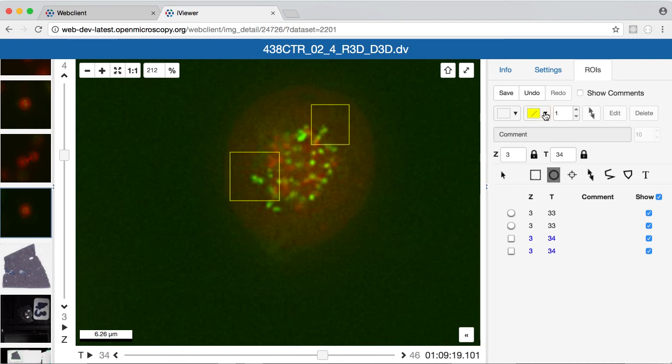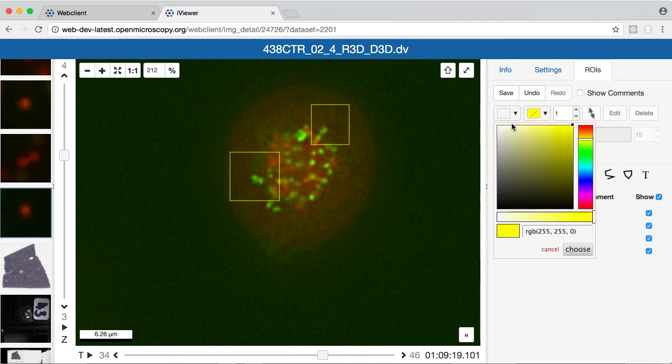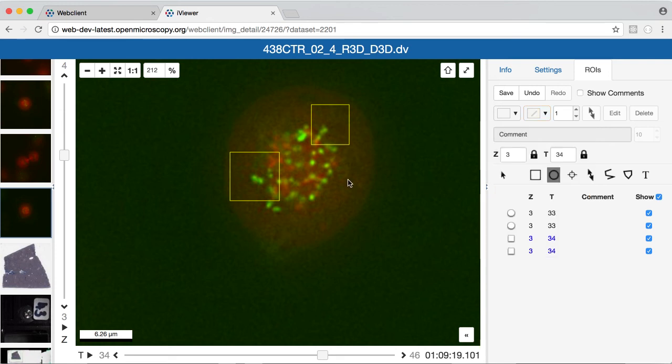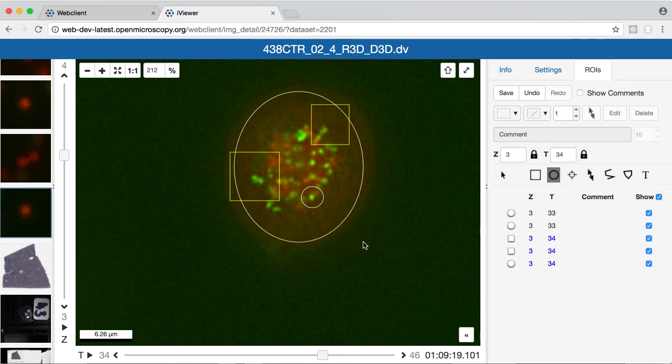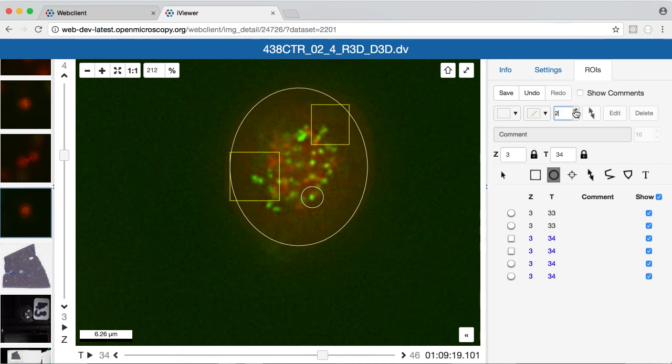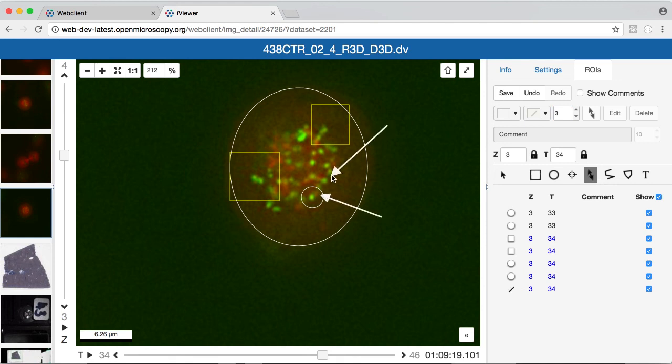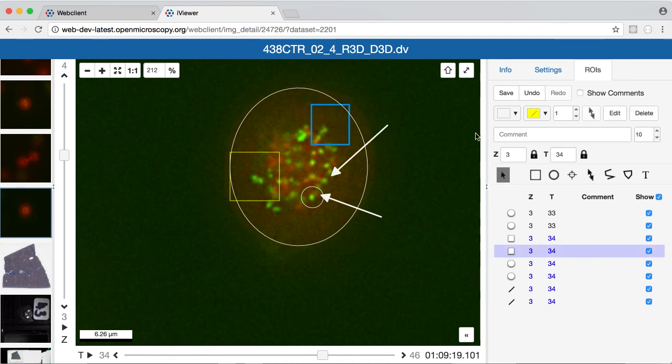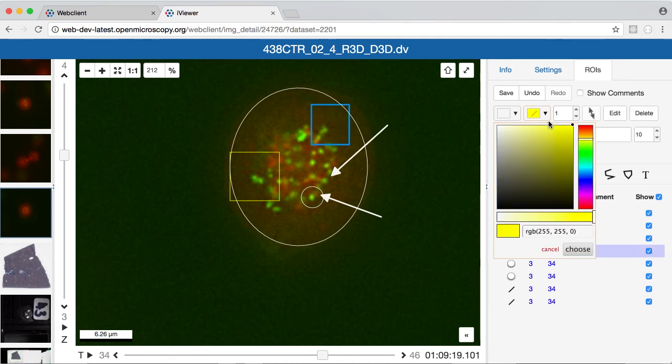So I can choose new colors for shapes while I'm creating them, and I can also choose different line widths. And I can also, using the select tool, select and edit existing regions.